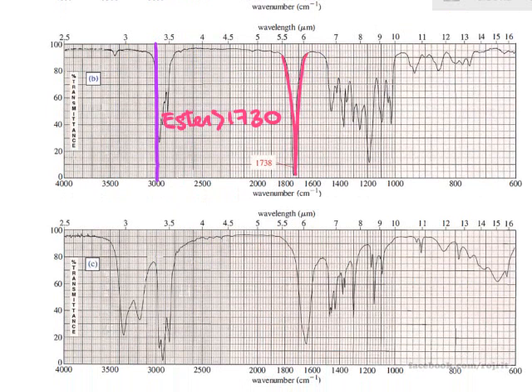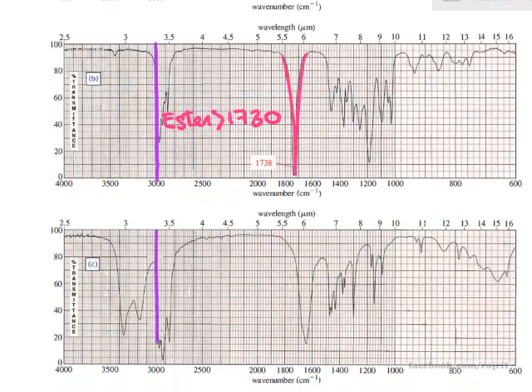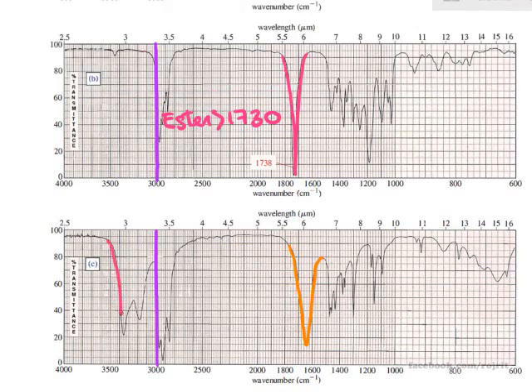Okay, now next is sample C here. Again, mark 3000, right? And you see that it is only alkane. And what you can see rather than the alkane is a 1600-something carbonyl again, right? But the carbonyl is less than 1700, indicating the resonance effect, 16 something. You have resonance with something else, and it's the amide, resonance with the NH, right? Because you have very strong absorption of NH as two spikes like this, indicating the primary.